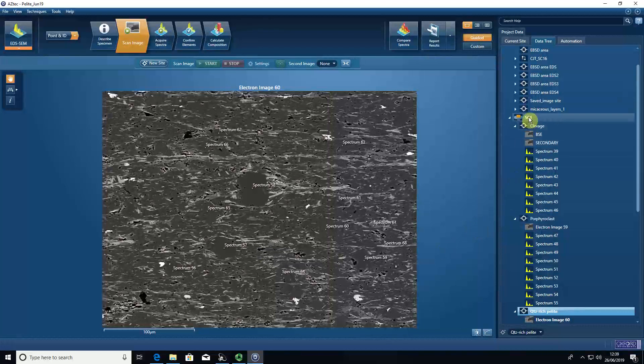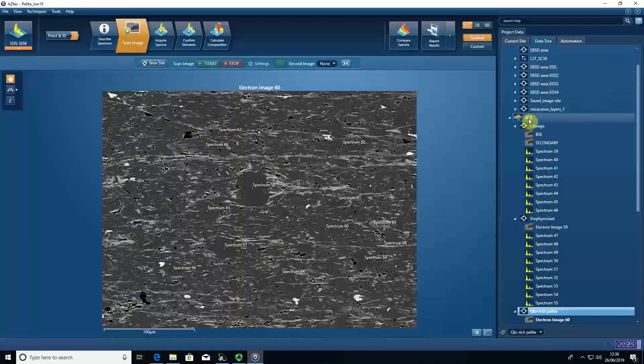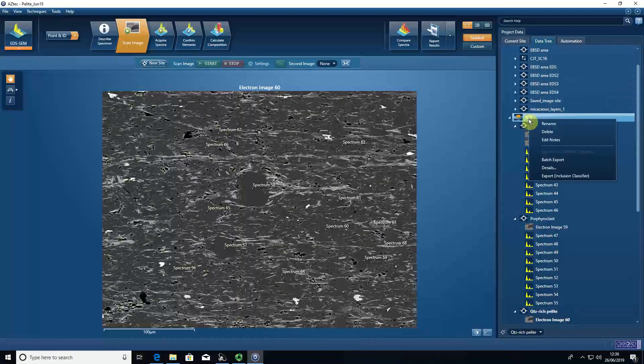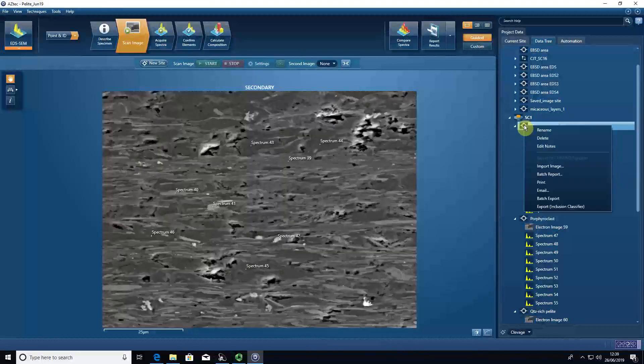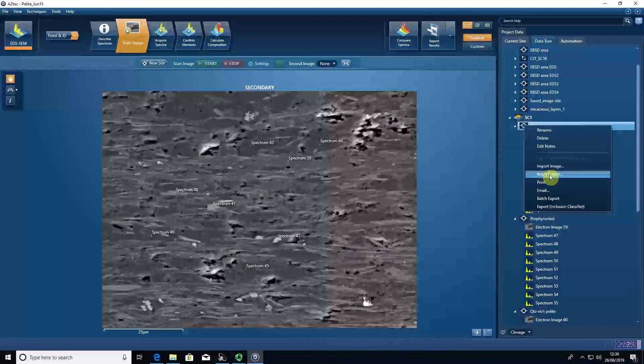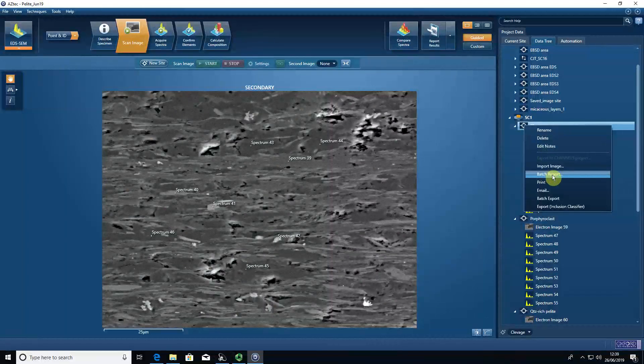We can then, in the data tree, click on a sample, on a site, and we have batch report.